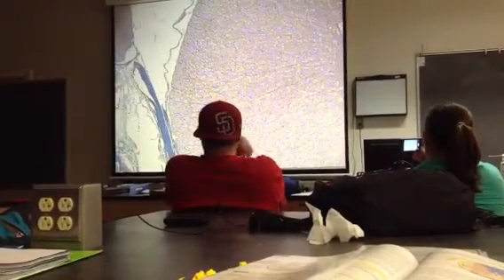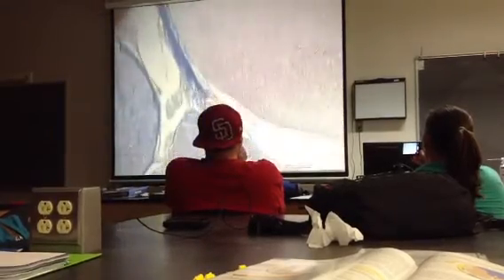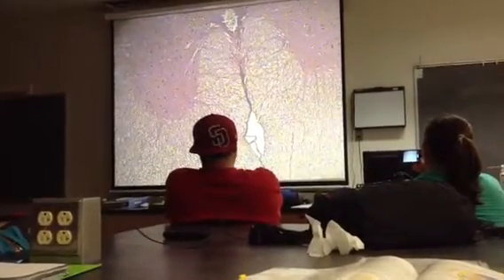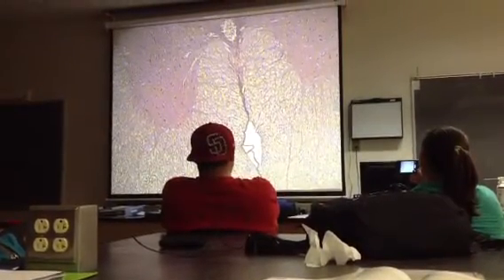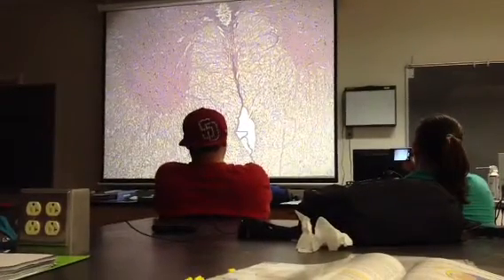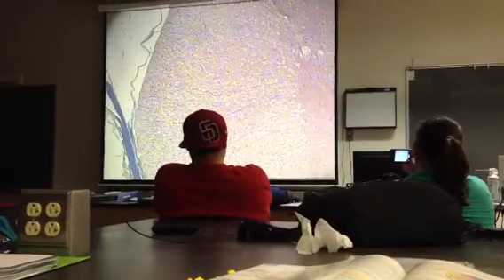Okay, so then I moved over here laterally to the central canal. What's this mass of white matter called? Lateral white column. Good. And then what's in between here? What's this mass of white matter? The anterior white column. Good. Is this motor or sensory? Motor. Is this an ascending tract or descending tracts? Descending tracts. Good. You're getting it. And remember the lateral was pretty much split right in half there.